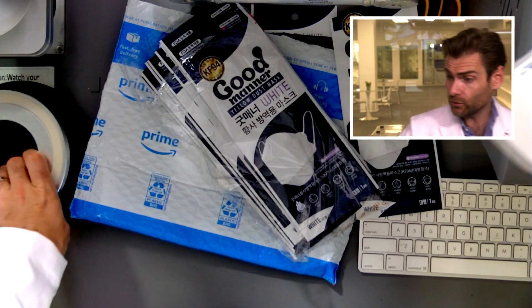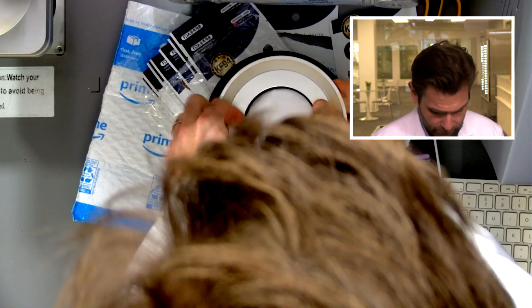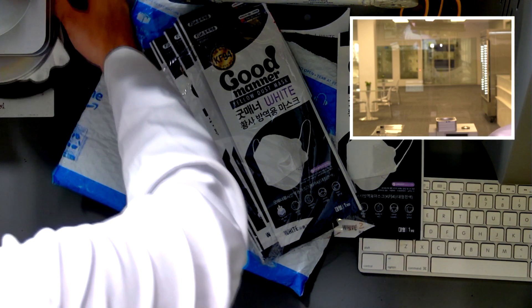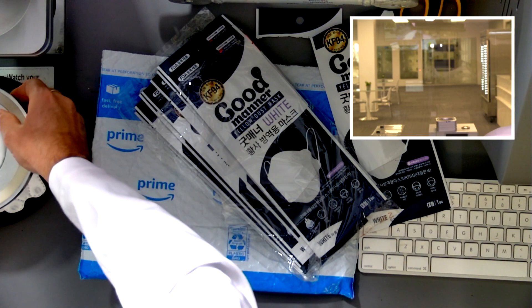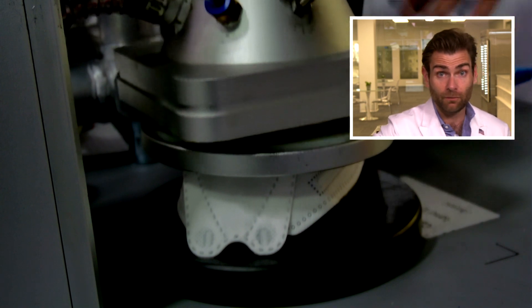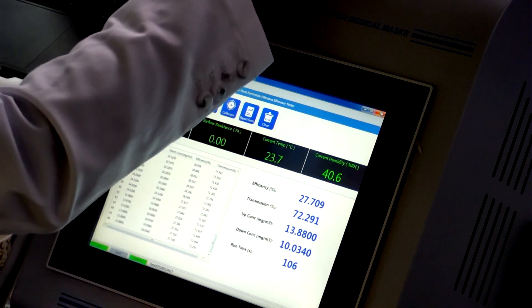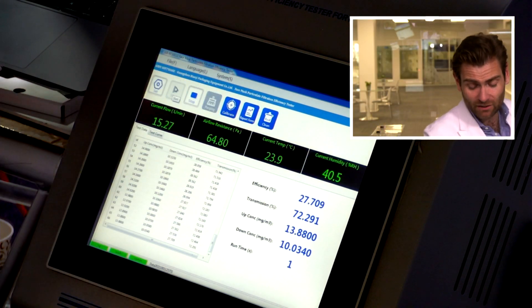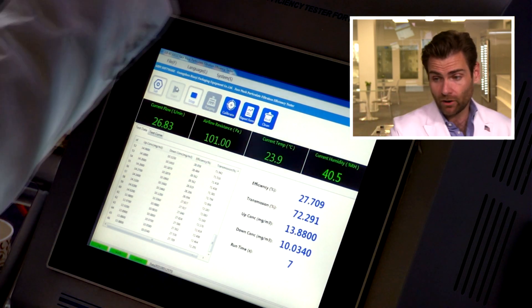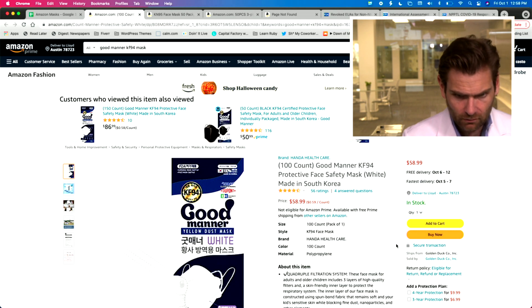Interesting — there's no writing on this. Let's put it in the clamp. This is a specialized clamping apparatus that we use here. This isn't what we use in our official NIOSH tests — it's just a really easy way for me to do these tests quickly since I'm impatient. This is a PFE machine — particulate filtration efficiency machine. If you want to find out more about how this differs from our other setup, check out that link above. We'll let that run.